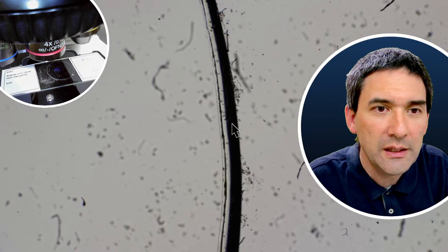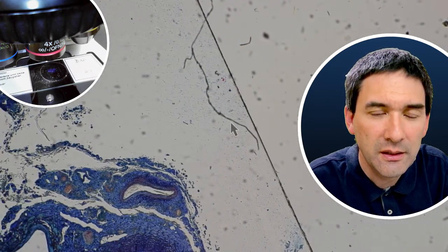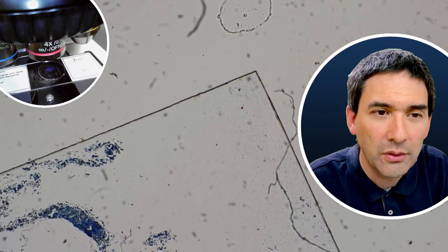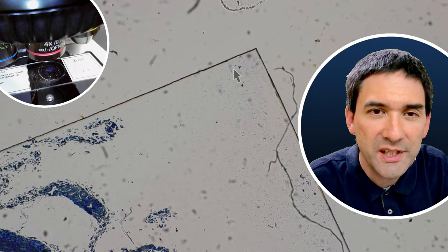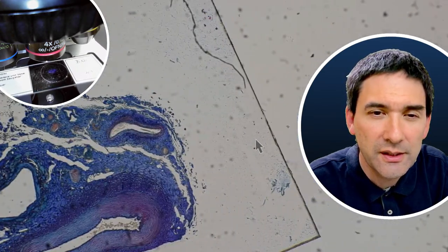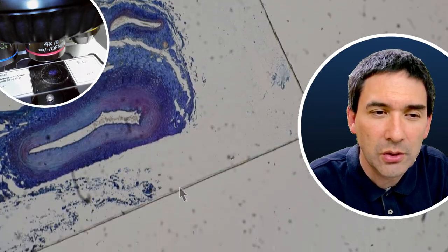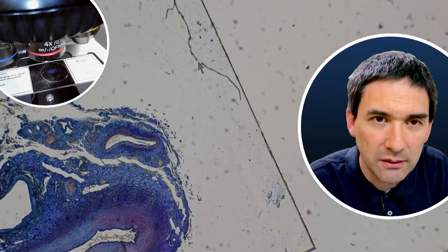But when you go in, you can actually see that the actual specimen is inside this block of foil-like thing here. So it was embedded in some kind of a resin, I suppose, and then also cut. That's quite interesting to see. Essentially it is embedded in some kind of a resinous material, which was then cut. So there must have been some kind of a block here.